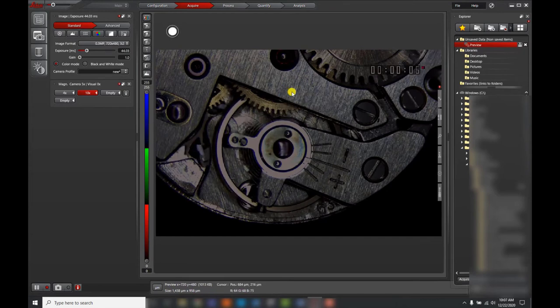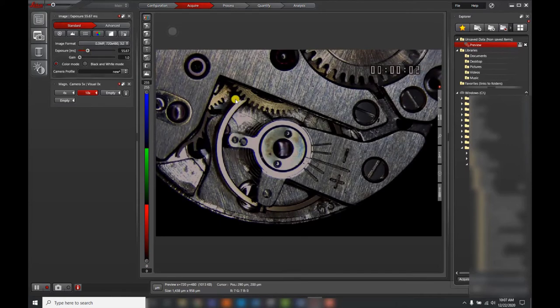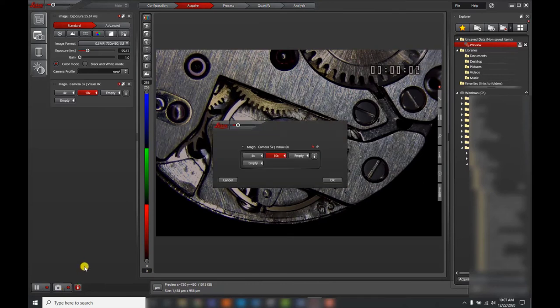know is white. Depending on your setup or application, it may be helpful to remove your sample altogether when doing bright field, for example. Or if you're working on a reflected light stereo microscope, you might want to add something that is white to the light path, like a white piece of paper. Once the white balance has been completed, just press the Capture Image button at the bottom left-hand corner.